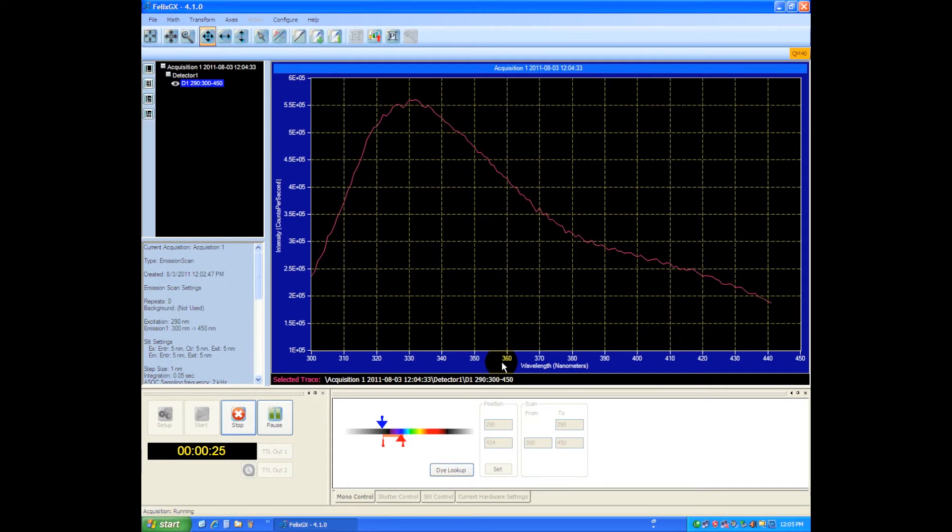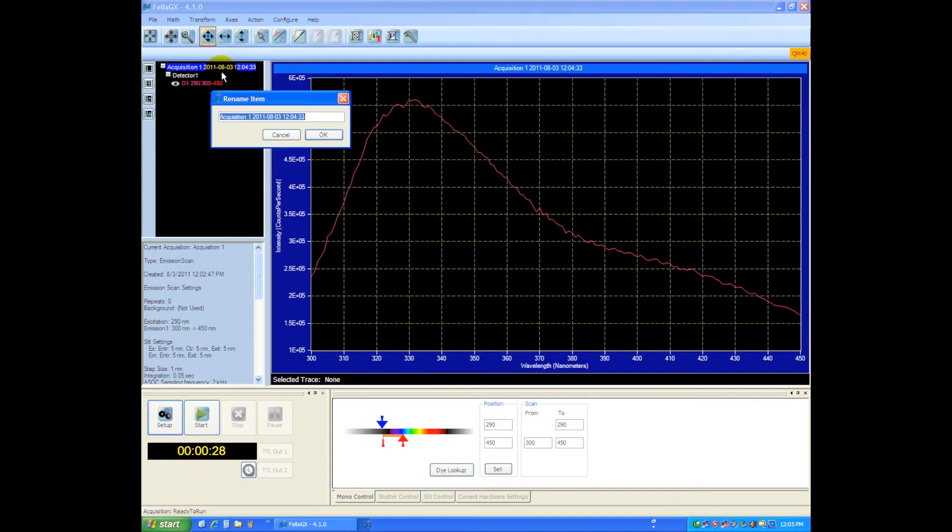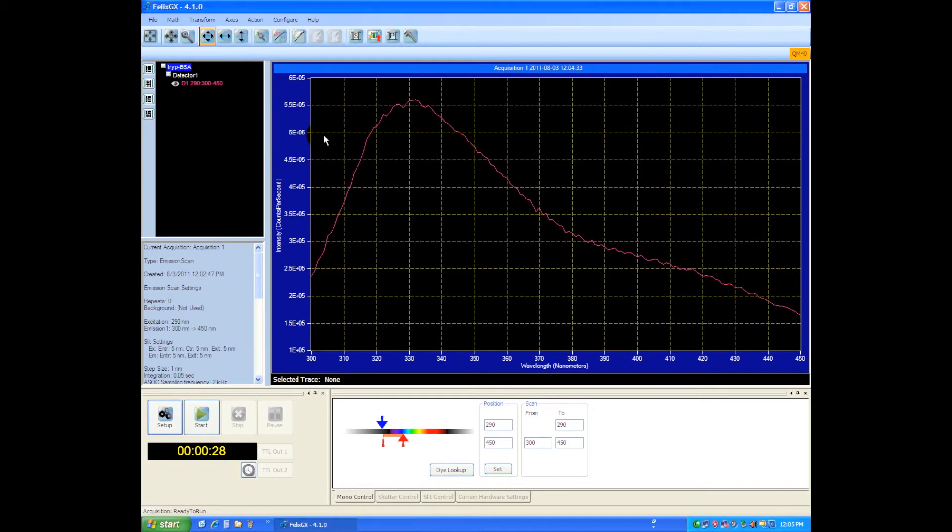Once this is done we can save the scan or we can rename it. Right now I have this called acquisition and the date and the time are in there, but if I want to I can rename this and we can call this tryp-BSA, and we say okay and you can see that we've renamed that.